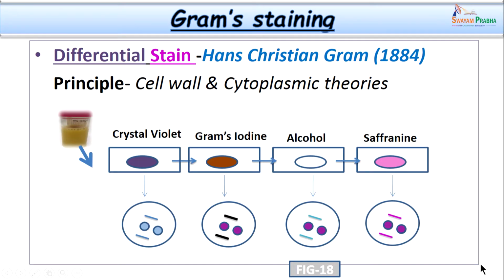Well friends, let us now consider some of the important stainings used day in and out in the microbiology laboratory. One of the simple and wonderful staining techniques we have is the Gram staining. As I said, it helps us differentiate bacteria into two major categories, Gram positive and Gram negative. You must be wondering how this differentiation takes place.